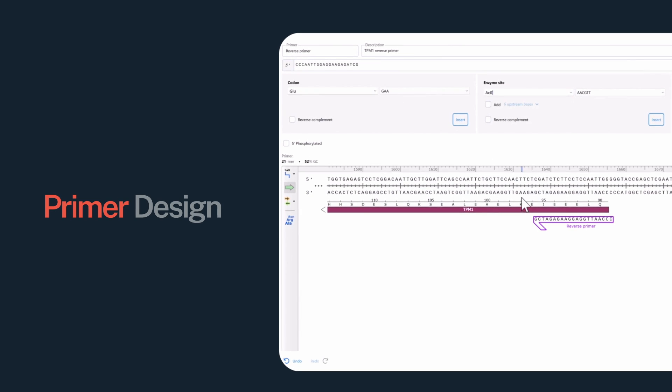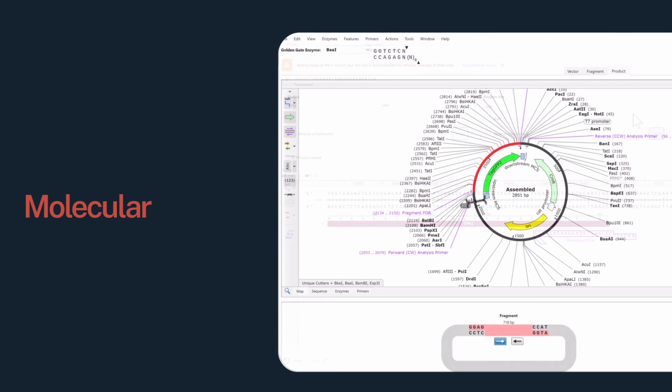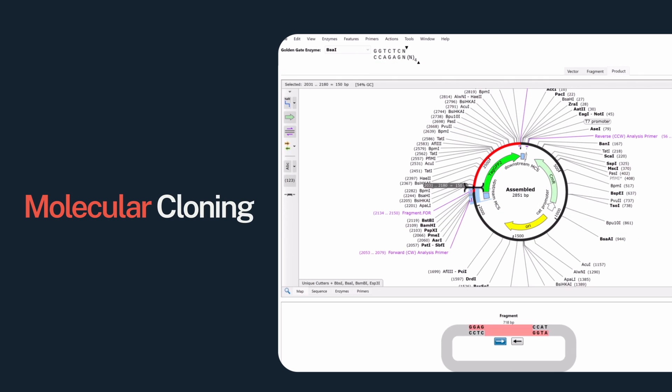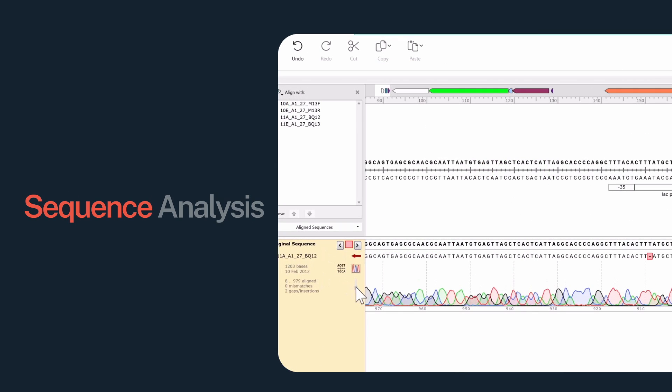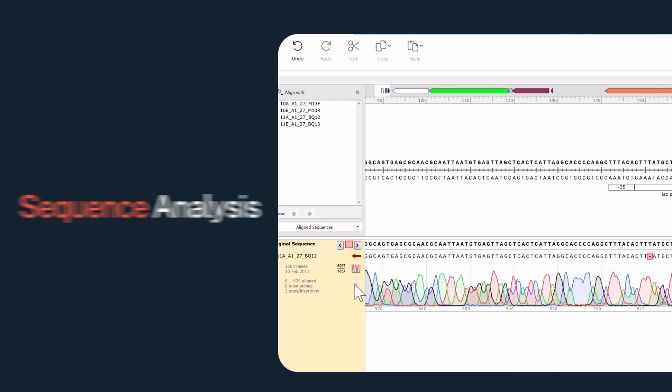Whether you're designing primers, cloning a gene or analyzing a sequence, SnapGene has the tools to do the job quickly, accurately and with confidence.